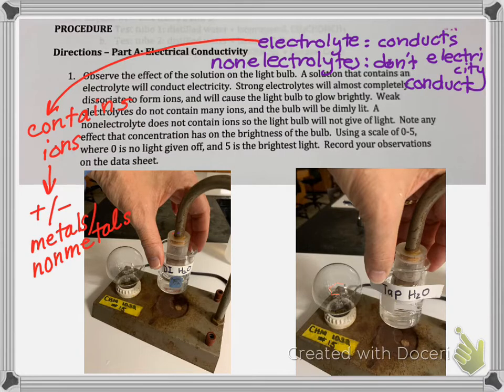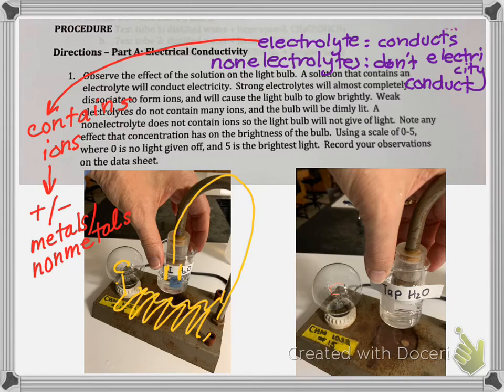So if you think of our light bulb, it has a little filament here, and then there's wires underneath this, and then there's wires that come in this tube, and when you get here, there's two electrodes that are far apart. And so we have wires going into the test tube. So it makes like a circle.